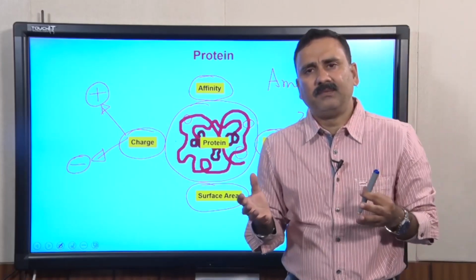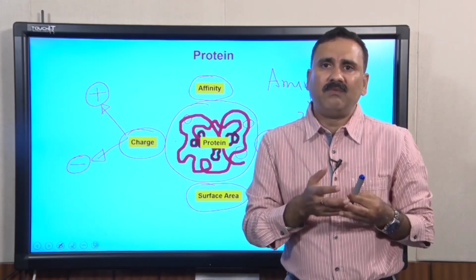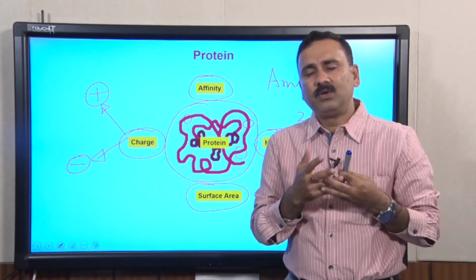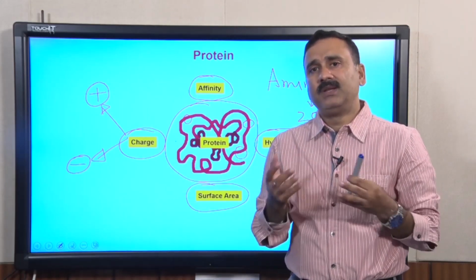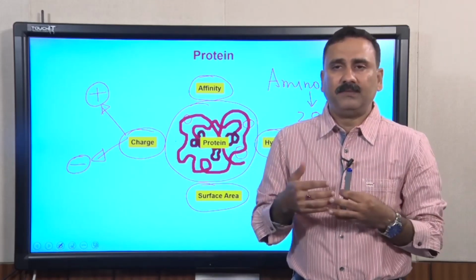This is just one example. There are many other examples where molecules have a very specific affinity for some ligands. For example, there are many dehydrogenases which have an affinity for NADH or NADPH, and in those cases you can use these ligands to purify the proteins.